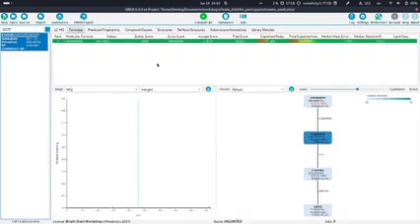Yeah, so this is what can also happen. Here you just have a very empty MS2 spectrum. So probably we will not be able to extract much information from this. Also another example where you should be careful.